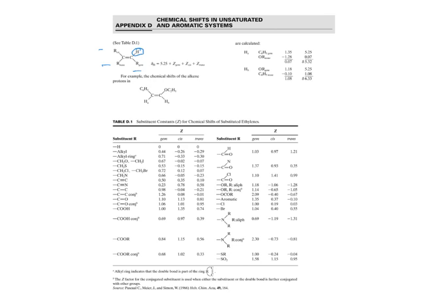And in this case, it's important whether that functional group is on the same carbon, geminal, or trans, or cis. So for any of these different groups, let's say we have a carbonyl that's conjugated, so it has a different effect. If it's on the same carbon, it's 1.06. If it's cis, 1.01. If it's trans, 0.95. So it just depends on where it is.